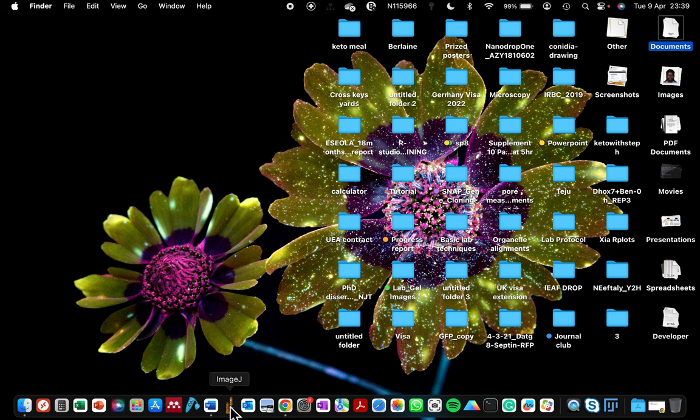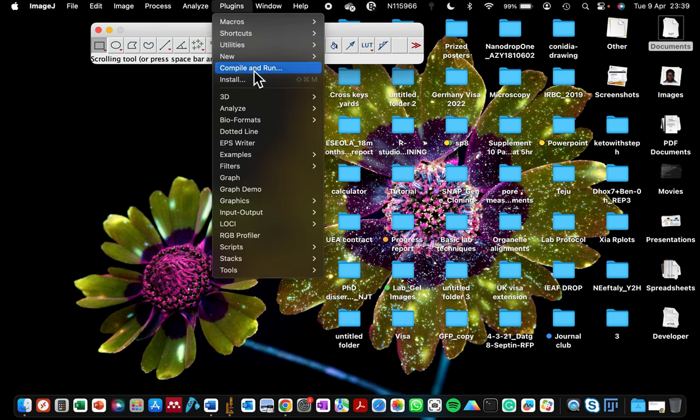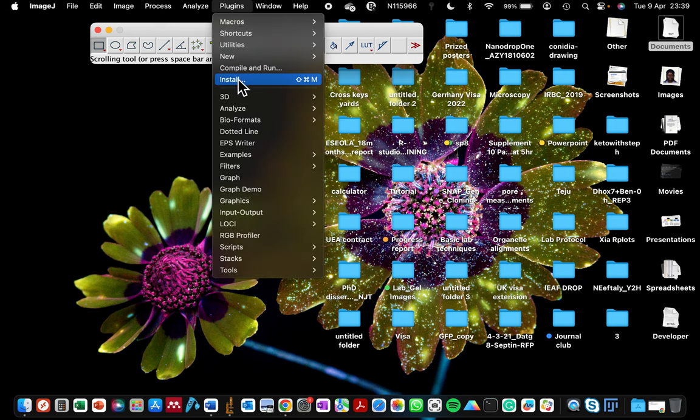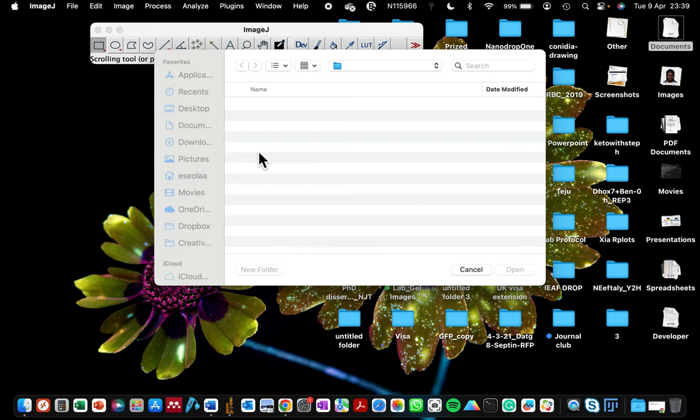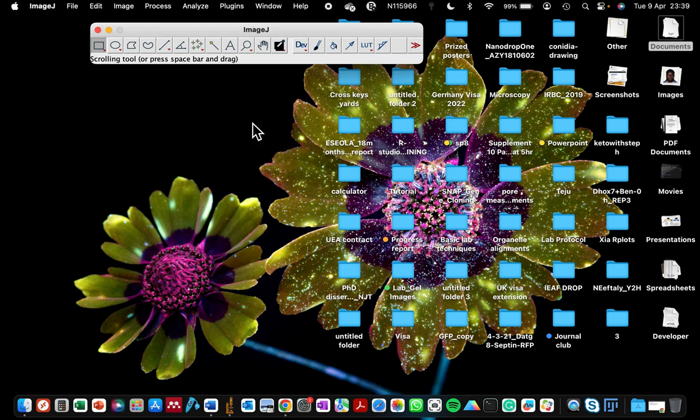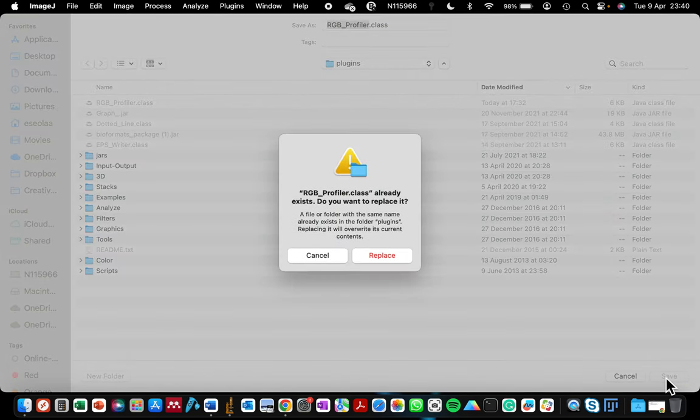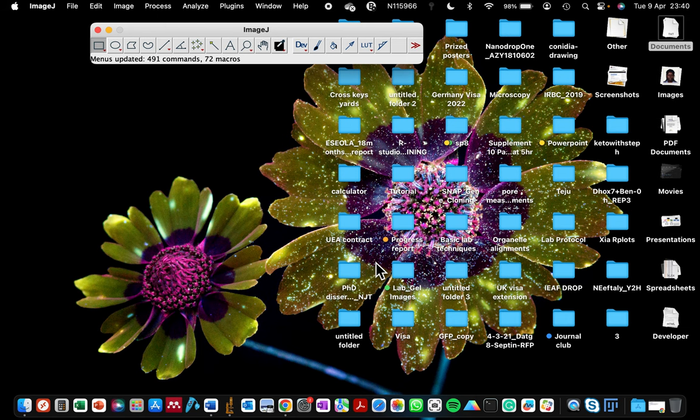Instead I'll open ImageJ. If I select ImageJ, you'll see that it is straightforward for me to install the plugin by going to plugins, install, and then picking that plugin that we downloaded. It opens a file path for us to decide where to save it. Just click save. Because I already installed the plugin before, I'll just click replace for the purpose of this tutorial.